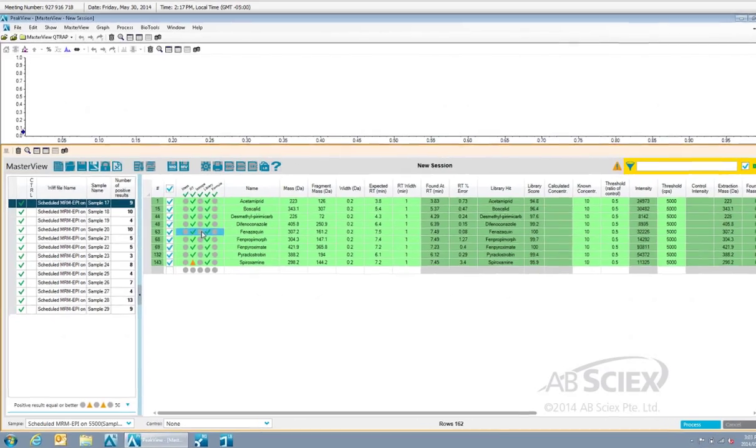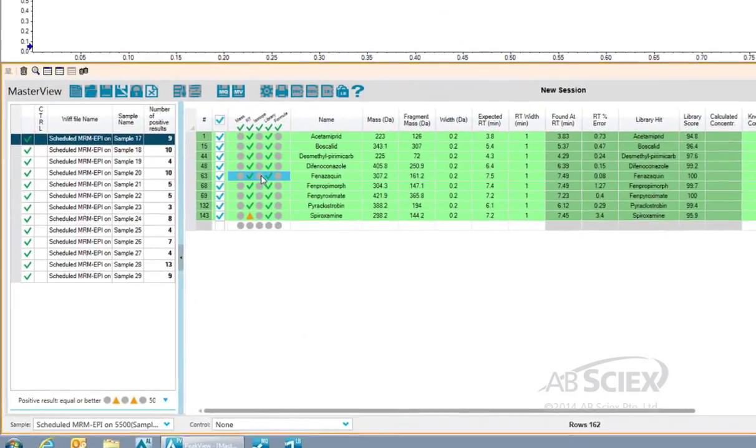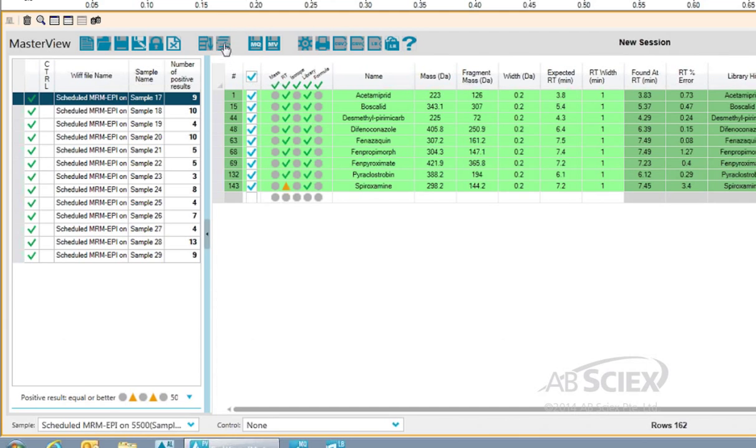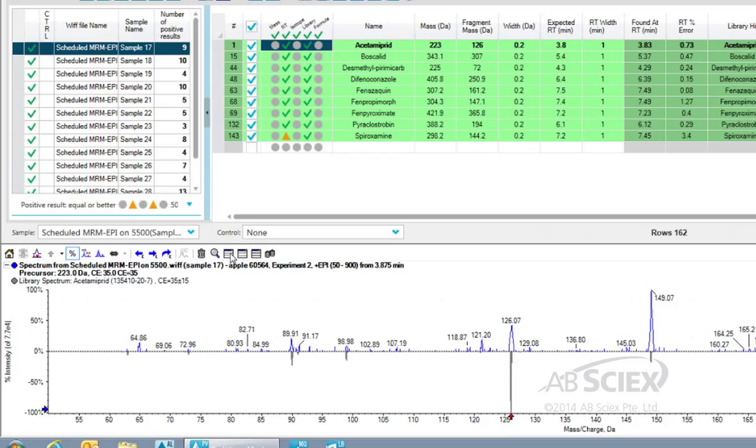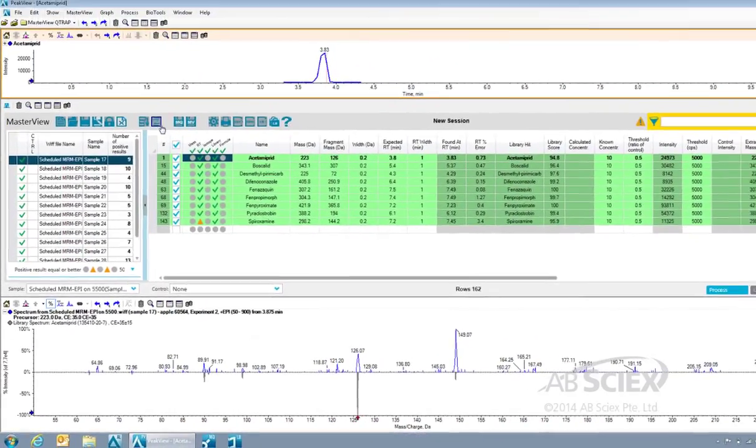To review the spectra for the compounds identified in our samples, we simply click the Show MS and MS-MS button, and the spectra panel appears where we can review our acquired data and how it compares to the library spectrum.